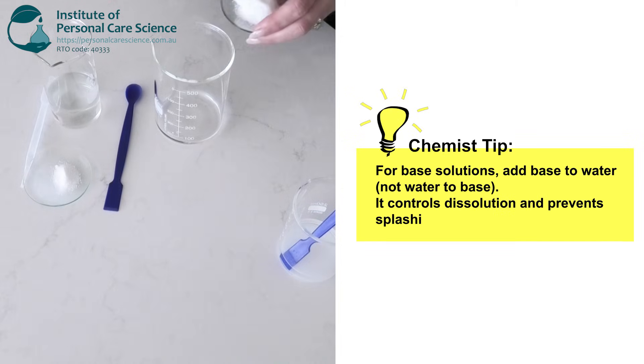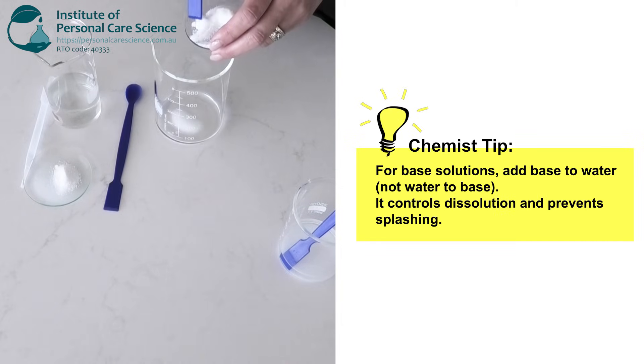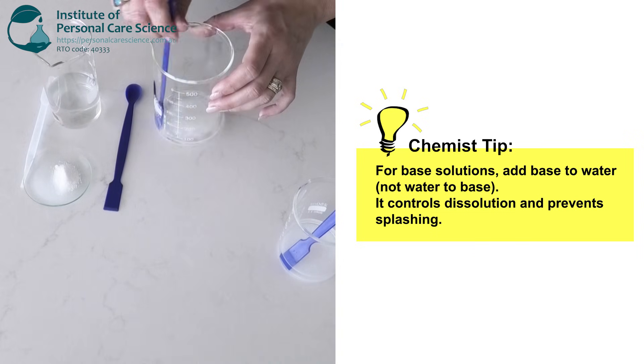It is important to note here that with base solutions like tromethamine or sodium hydroxide you should always add the base to the water and not the water to the base, and that's because dissolving bases in water can generate mild heat. So adding the base to the water allows you to control dissolution and avoid splashing.